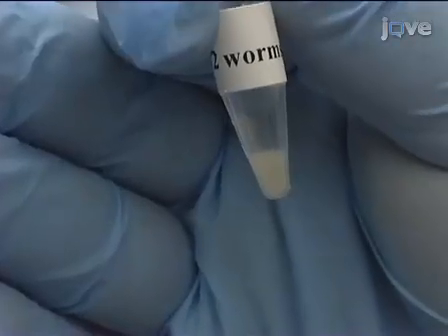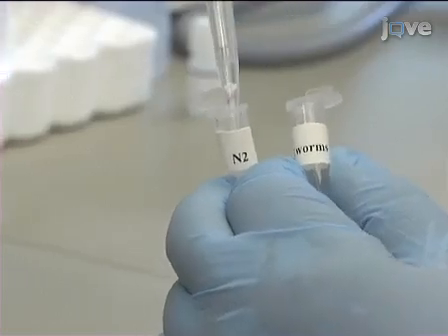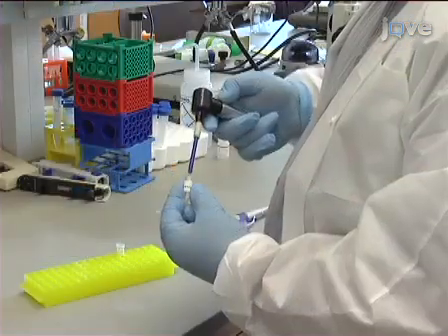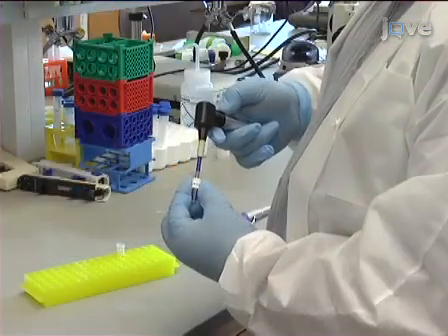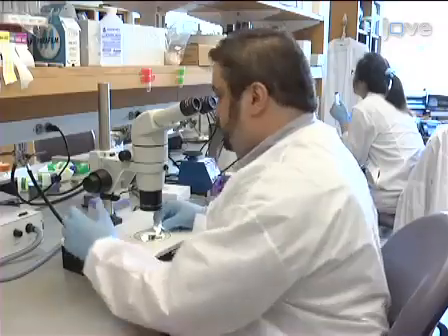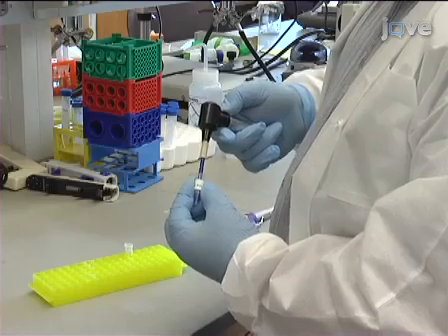Let the worms settle by gravity for 5 minutes. Then remove and save the supernatant in another tube. The following step is one of the most critical aspects of this procedure. The worms have to be completely disrupted by grinding prior to free metabolite analysis. Using a plastic homogenizer and motorized drill, grind the worm samples for 15 seconds. Visually confirm worm disruption by light microscopy, and repeat the grinding if necessary.